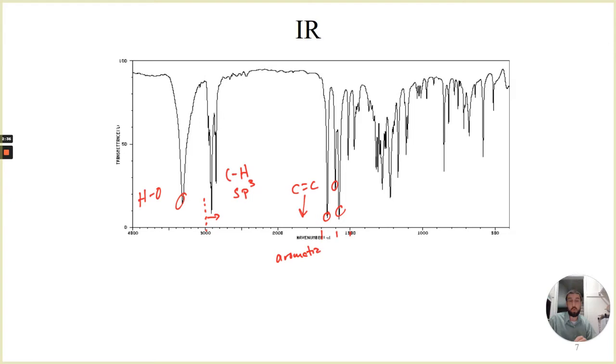For those people being like, okay, well now what's the answer? That's it. That's what you should be doing. You've now analyzed it. Those pieces can potentially take you somewhere else. We might throw in also the carbonyl with a question mark, but again, we aren't 100% sure. Don't worry about it.